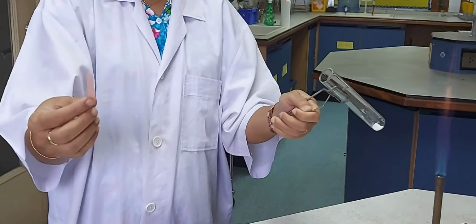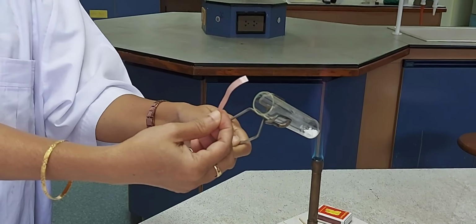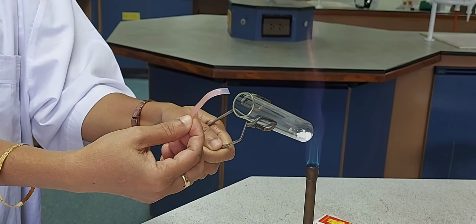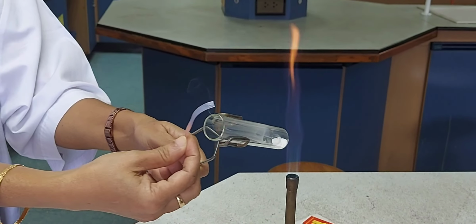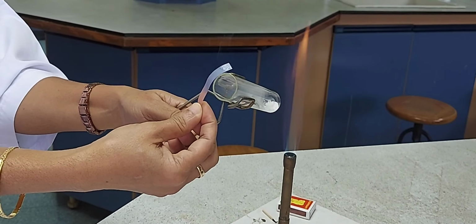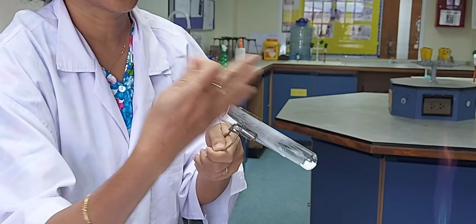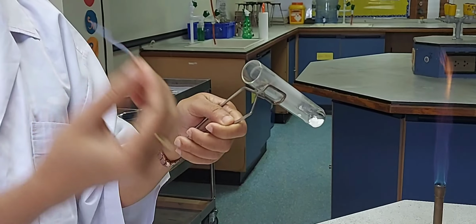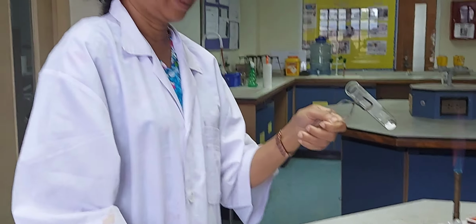This is a moistened red litmus paper which I will be showing to the mouth of the test tube, just to see if there is any gas being given out. Okay, so you can see that the red litmus is turning blue and a gas is being given out, which is turning the red litmus blue. So this is a clear indication. You can smell the gas and you can see that it has a pungent smell. It has turned the red litmus blue, so the gas is definitely ammonia gas.